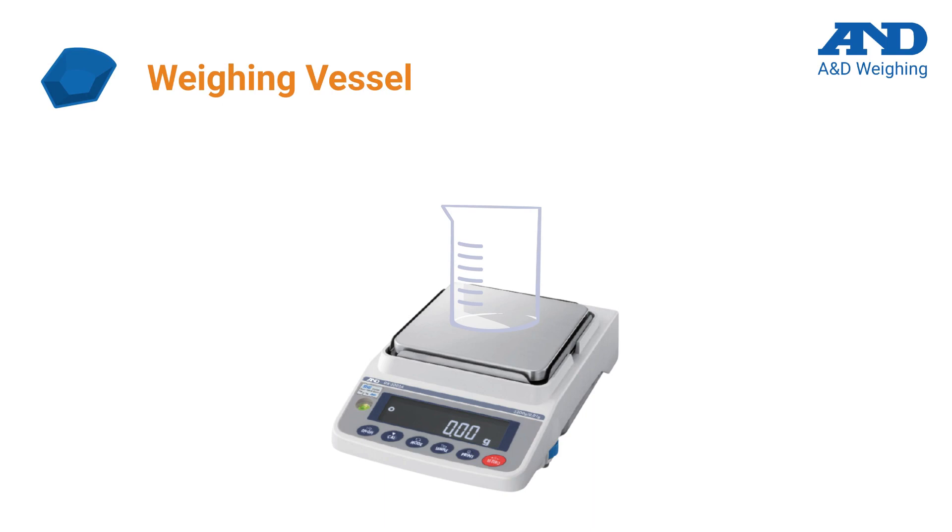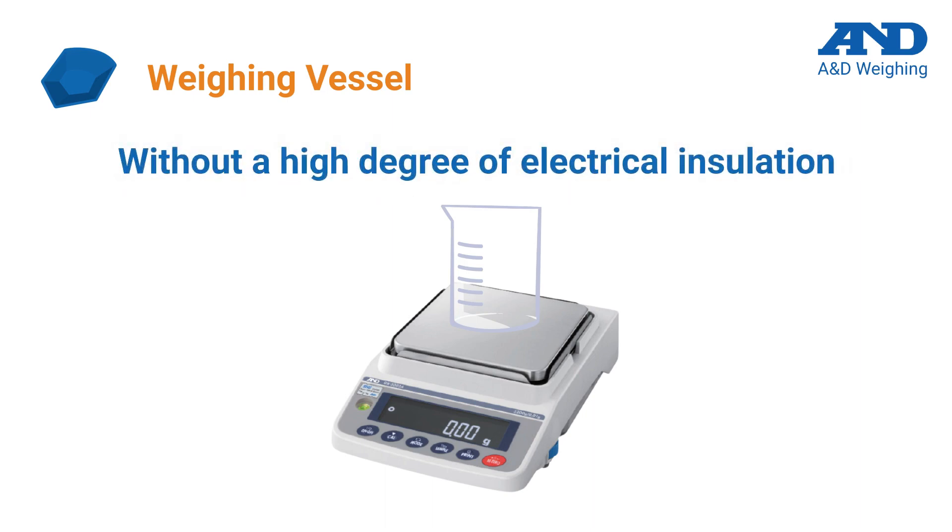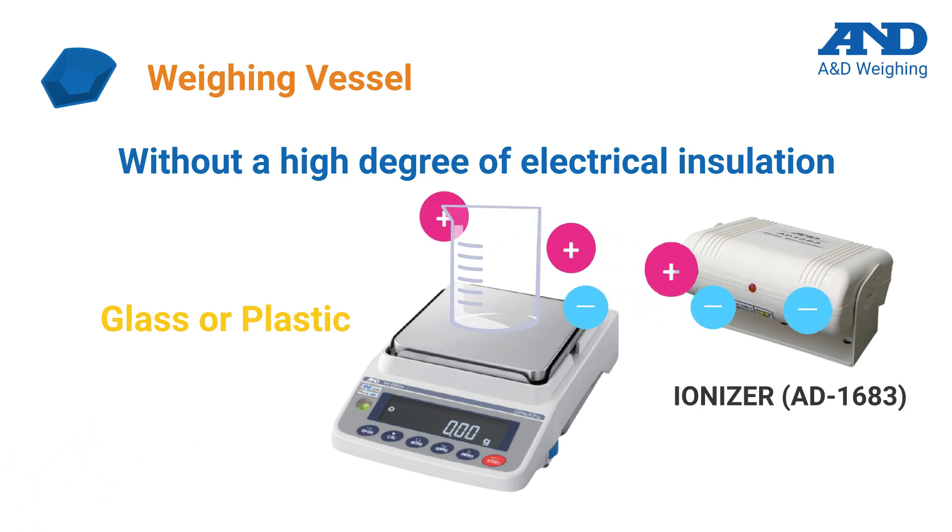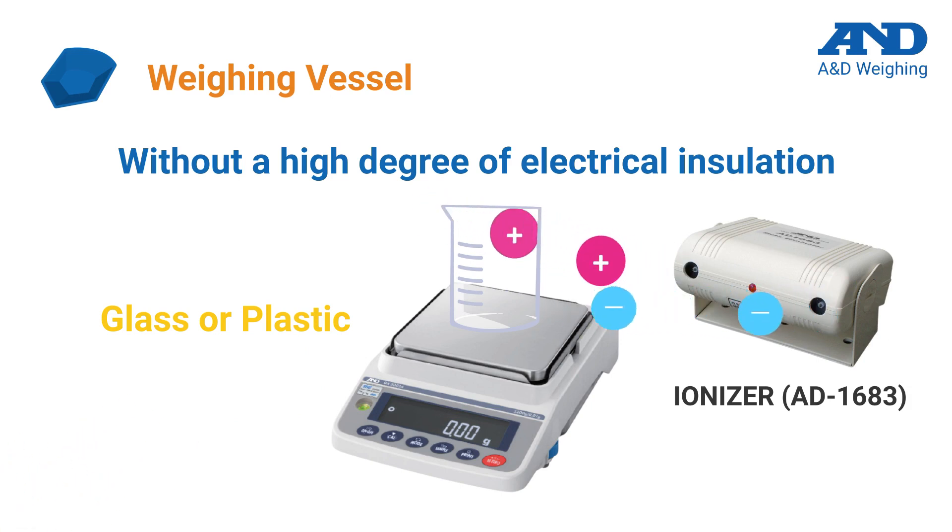When weighing inside a container, the smallest possible weighing vessel should be used to maximize the weighing range. You should also avoid containers or vessels with a high degree of electrical insulation, such as non-treated glass and plastic, which can become electrostatically charged. A&D offers anti-static solutions such as built-in ionizers and external pass-through ionizers, which work alongside anti-static coated glass components to minimize the effects of static electricity.